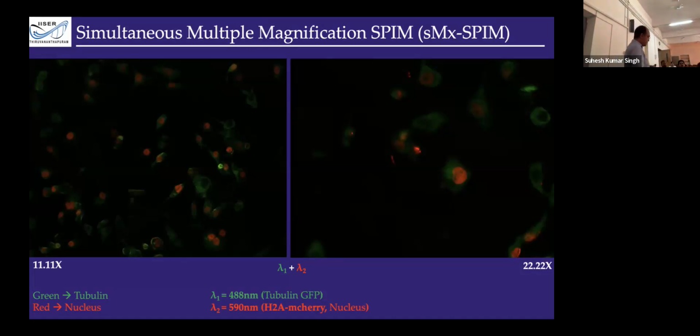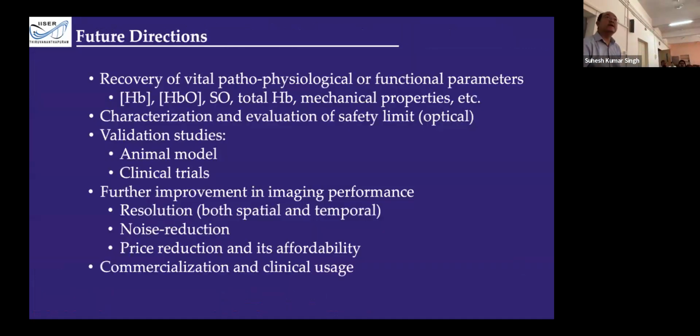Just to convey to you, we are facing challenges from the biological sample preparation point of view in taking it to 3 and more wavelengths. We are quite successful with 2. And if we are given a validation study for the multiple wavelengths, we can do that with the system.